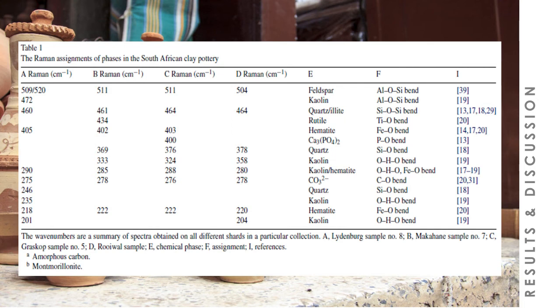This phase is most likely bone black for its corresponding peak at around 970 cm to the -1. Anhydrite phase was also implied in the Raman bands. In XRF, residual SO3 was detected, but as expected, this anhydrite phase was not shown through XRD results.